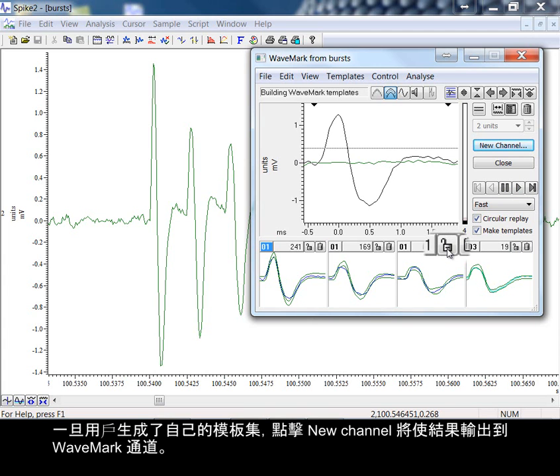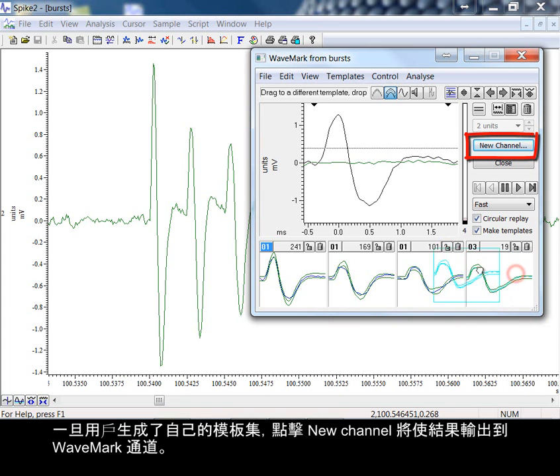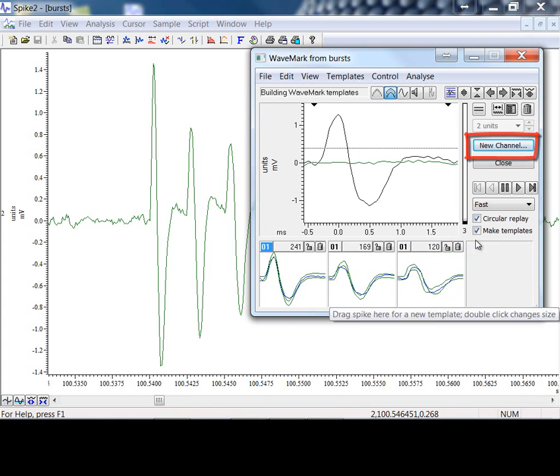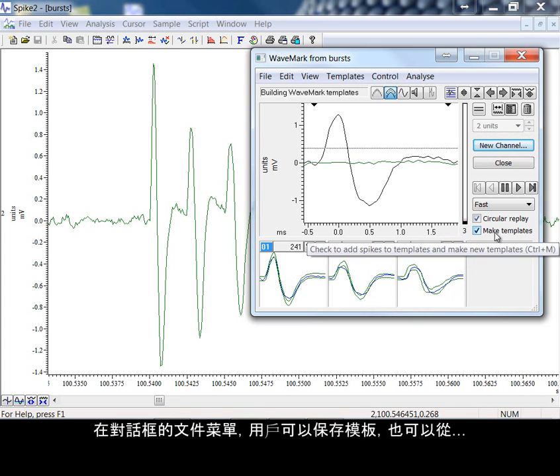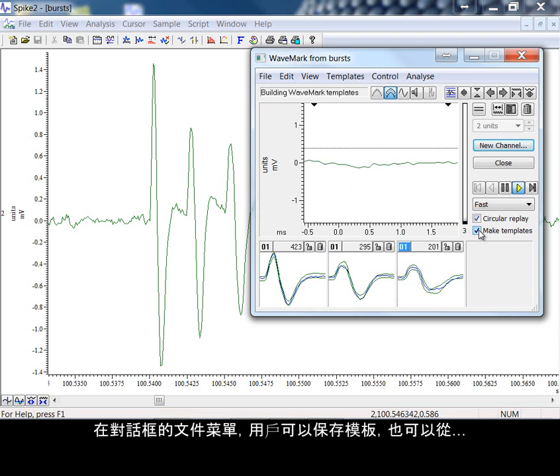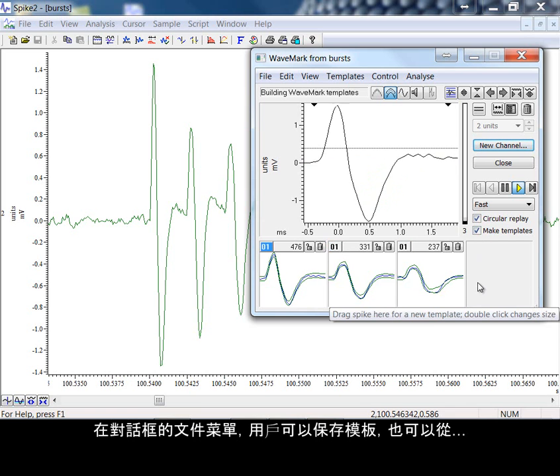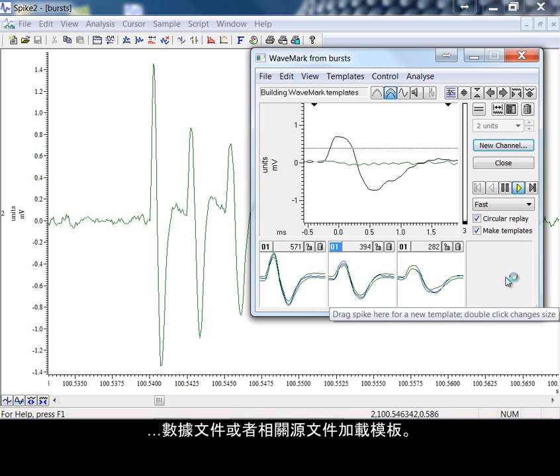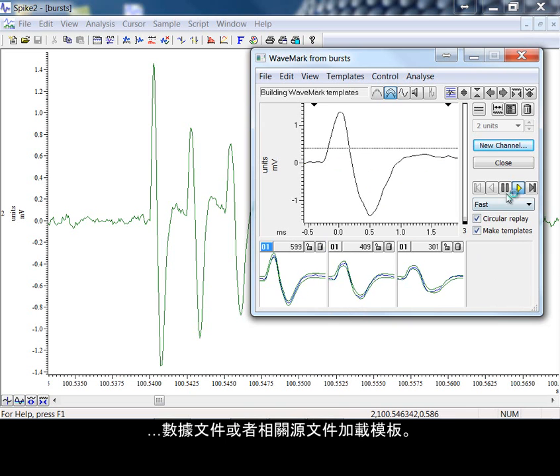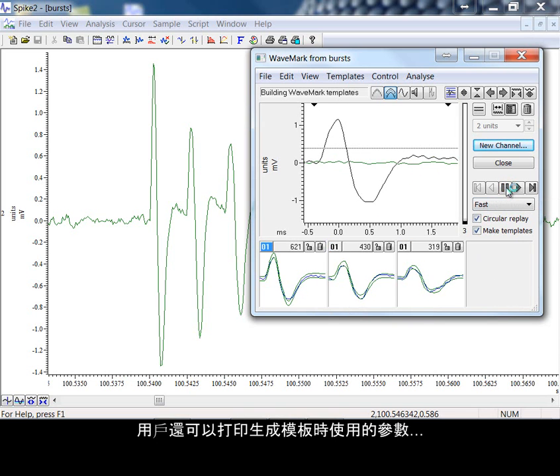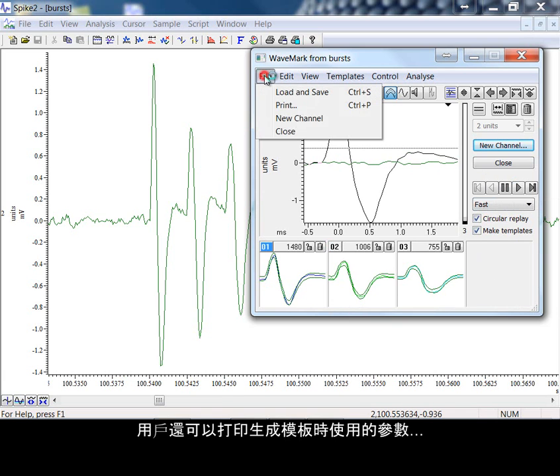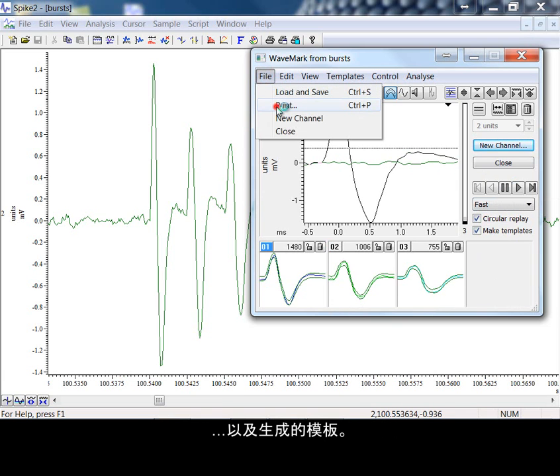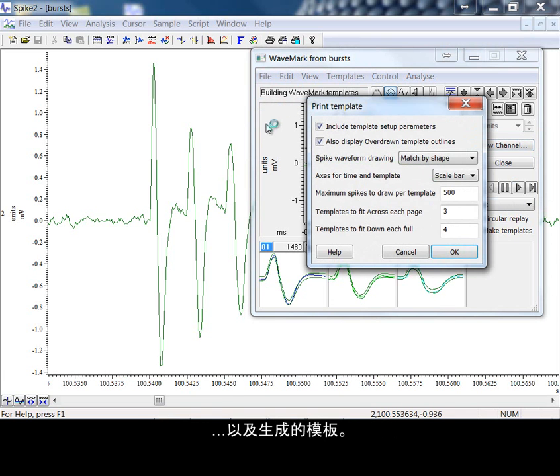Once you have your set of templates formed, pressing new channel will produce the output to a wave mark channel. From the file menu of the dialog, you can save templates and you can also load templates from either data files or from their associated resource files. You can also print the parameters you have used in generating templates and also the templates that you have formed.